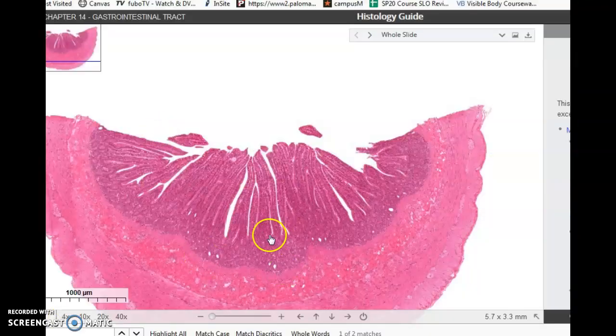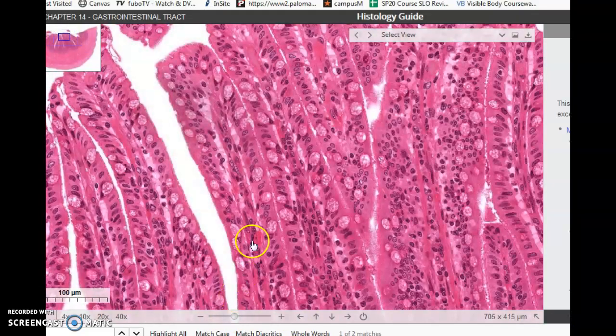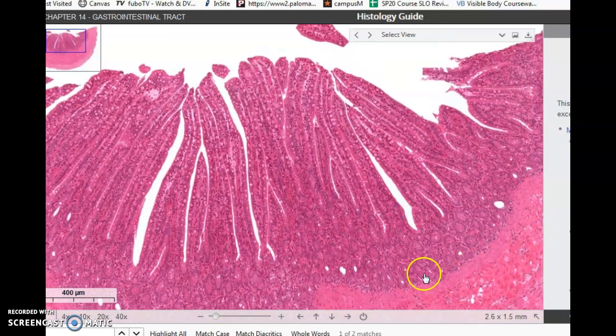So here's our jejunum slide with our very boring mucosal layer. Just zoom in until you see the goblet cells. So these are beautiful goblet cells. I'd rather you zoom in and see what a goblet cell actually looks like. I have a thing for them. And get just the villi and the submucosa. I think we memorized by now circular muscularis, longitudinal muscularis.